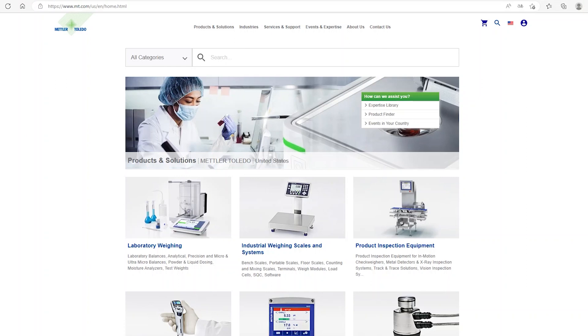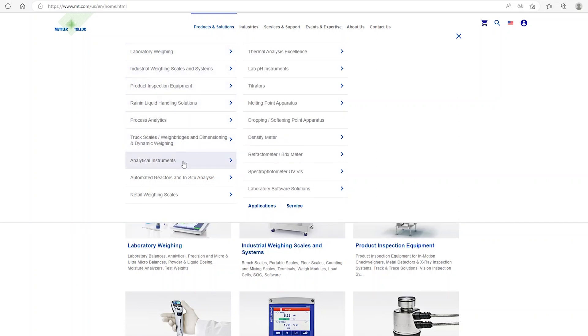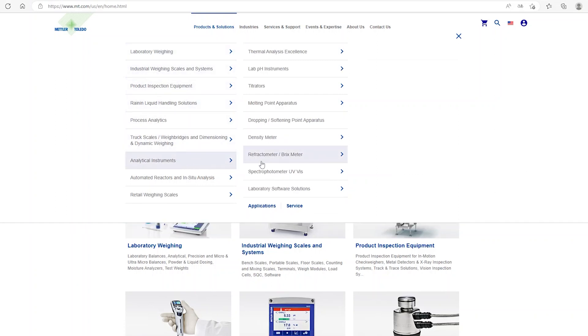This is our homepage mt.com. Let's navigate together the application library. Click Products and Solutions, move to Analytical Instruments and click Applications.